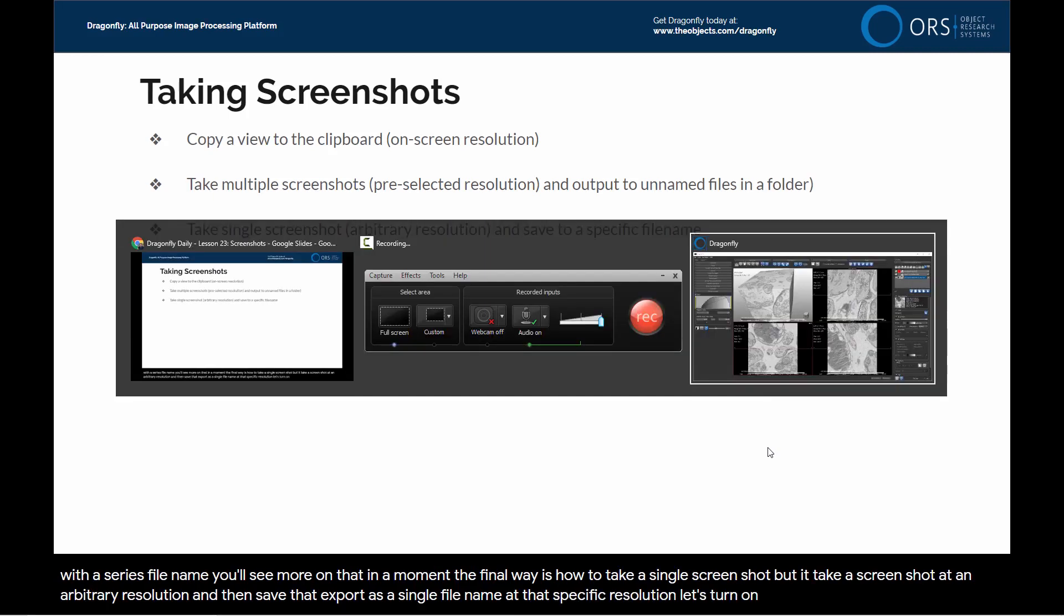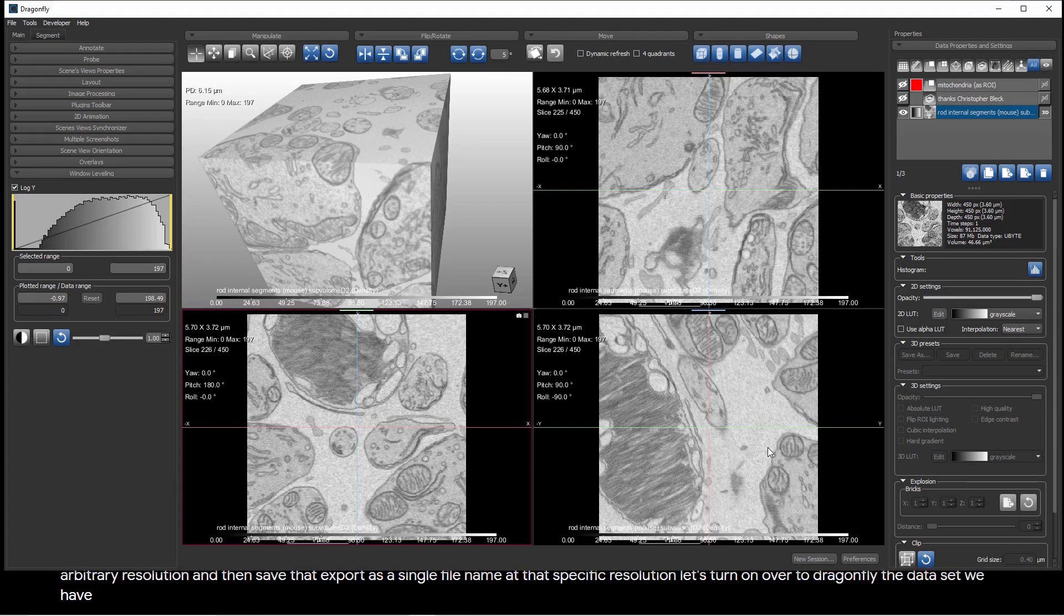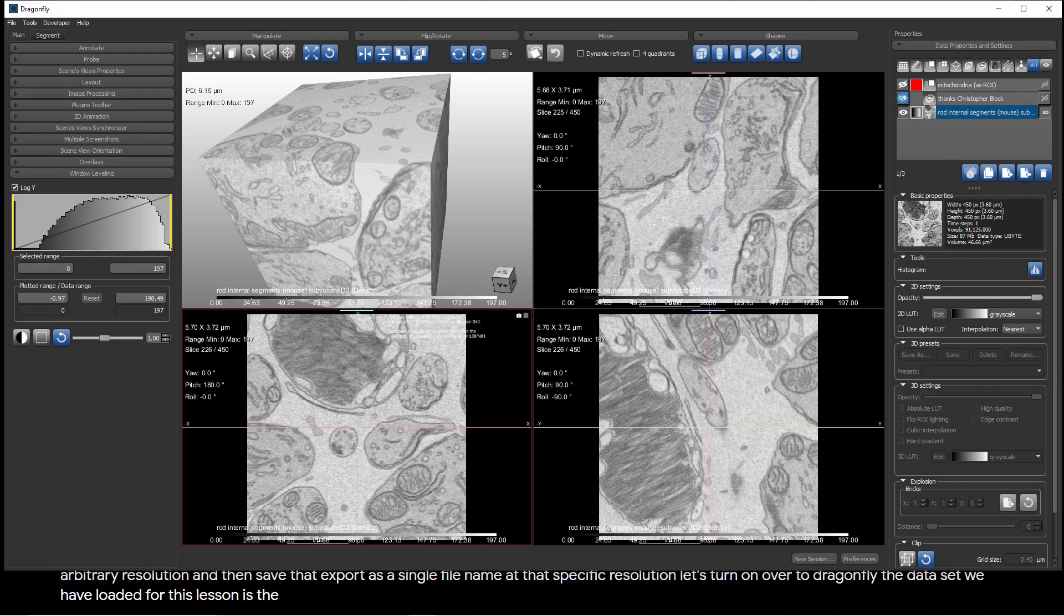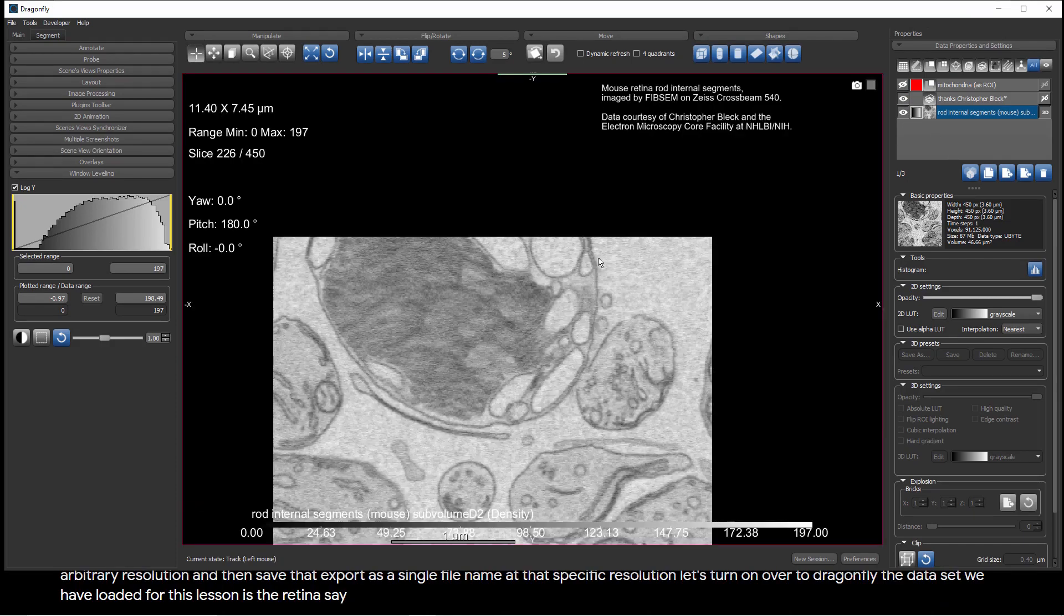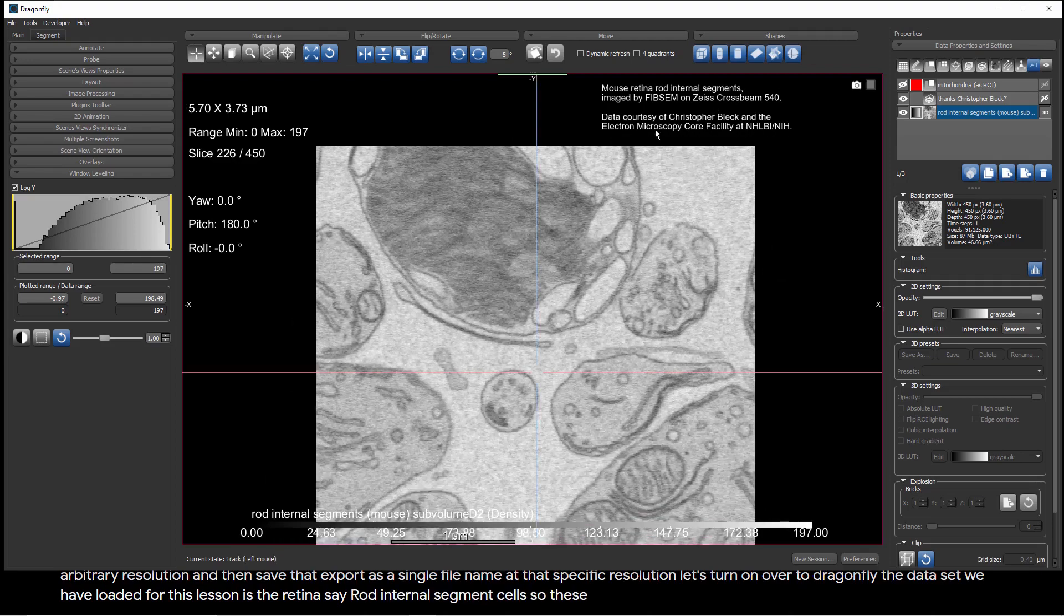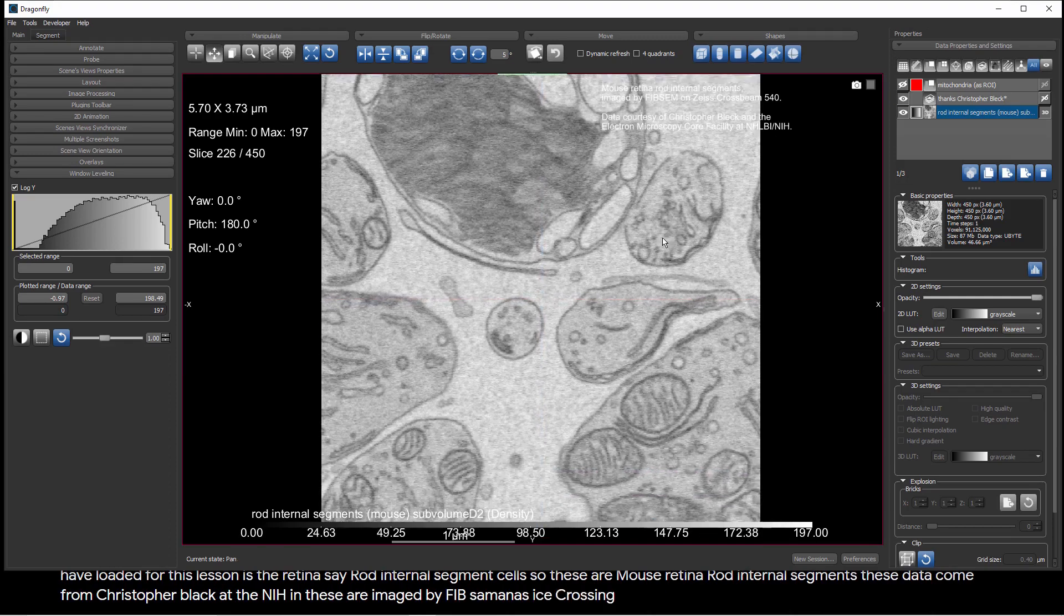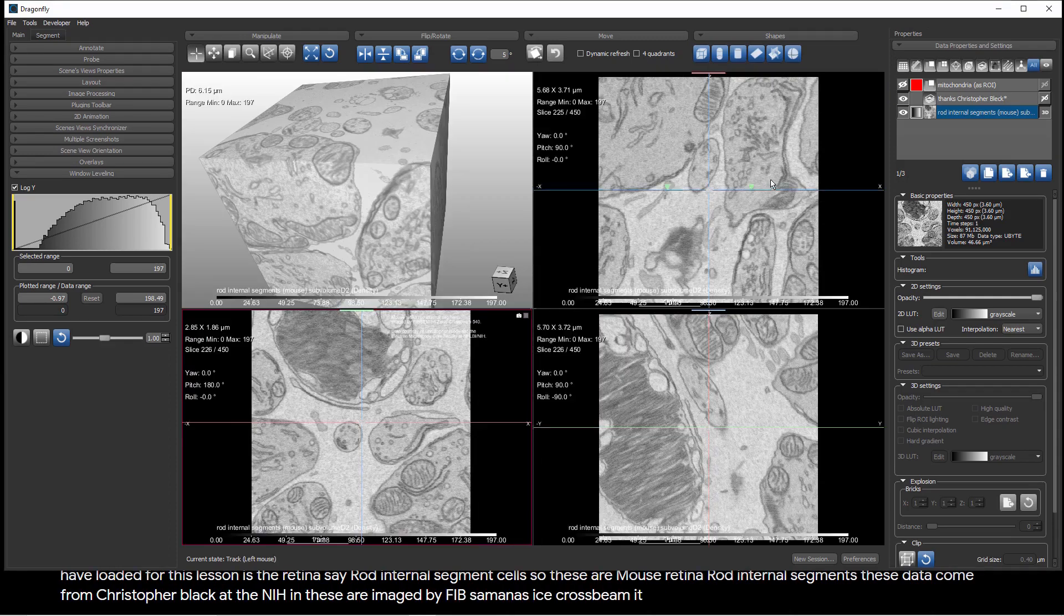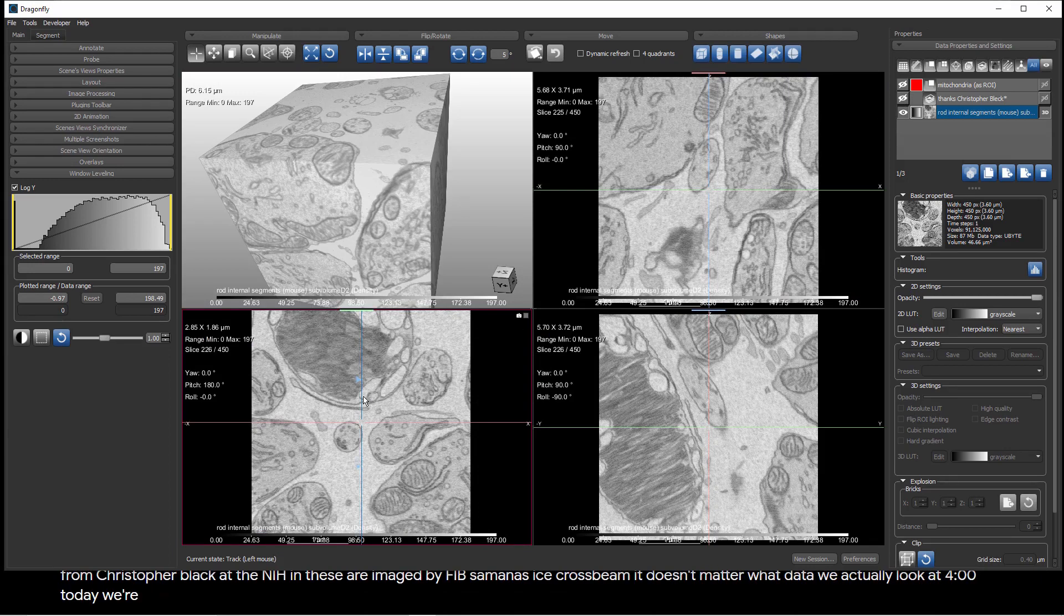Let's turn on over to Dragonfly. The dataset we have loaded for this lesson is the retina, I should say, rod internal segment cells. So these are mouse retina rod internal segments. These data come from Christopher Bleck at the NIH, and these are imaged by FIB-SEM on a Zeiss Crossbeam. It doesn't matter what data we actually look at for today. We're just going to show you how you can capture screenshots.